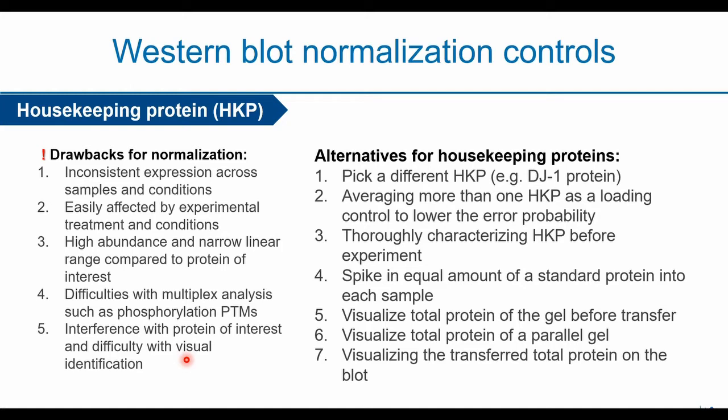And finally, it contributes to the difficulty in visual identification if you want to detect them at the same time. So there are a lot of things to consider, even antibody choices and so on. But I will not go into details.